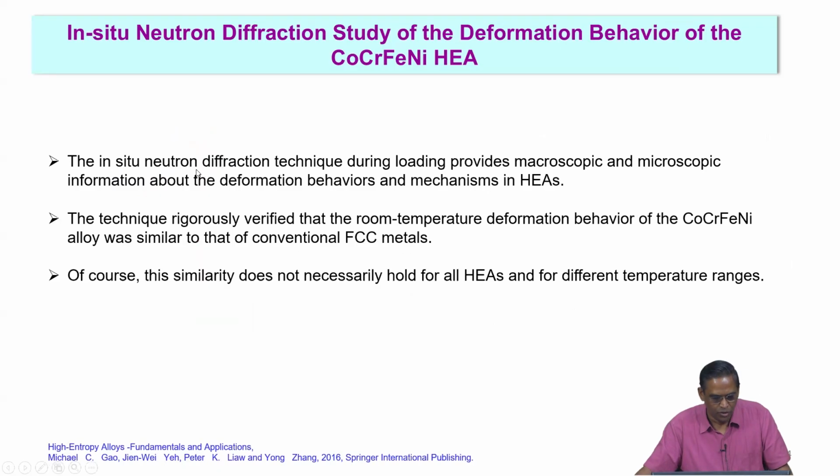So, the in situ neutron diffraction technique during loading provides macroscopic and microscopic information about deformation behavior and mechanisms in high entropy alloys. The technique rigorously verified that the room temperature deformation behavior of the cobalt chromium iron nickel alloy was similar to that of conventional alloys. Of course, this similarity does not necessarily hold for all high entropy alloys, right, and for different temperature ranges.